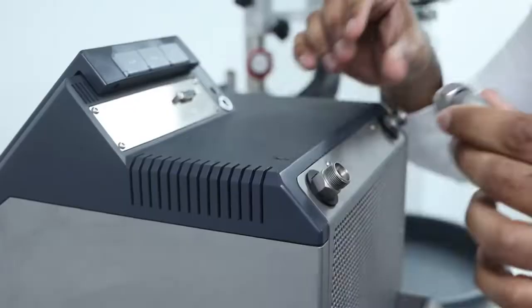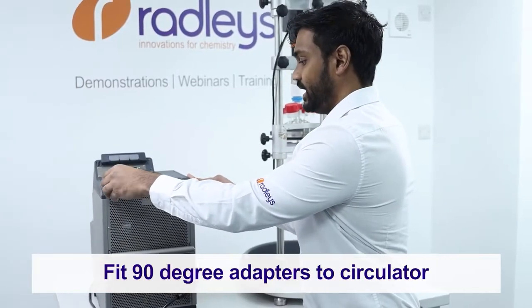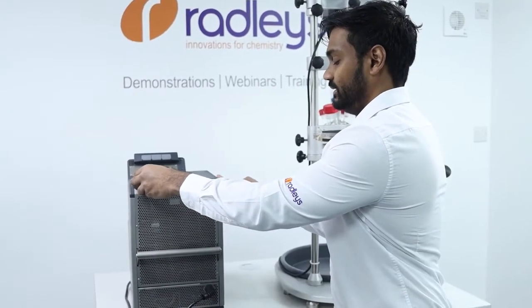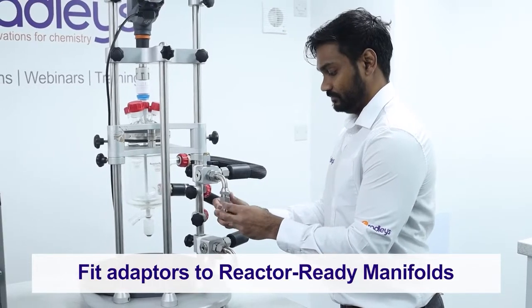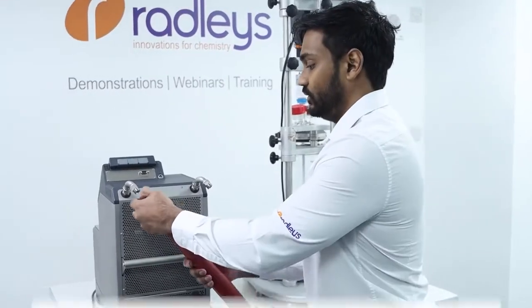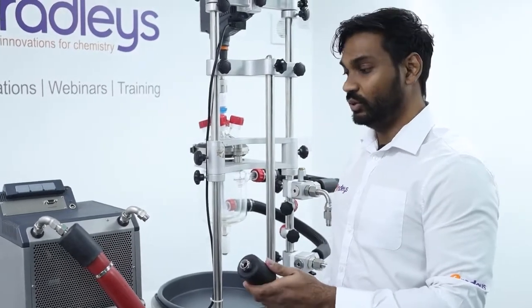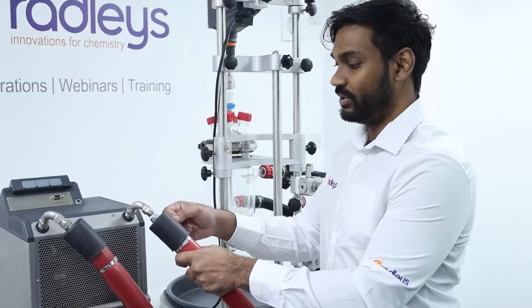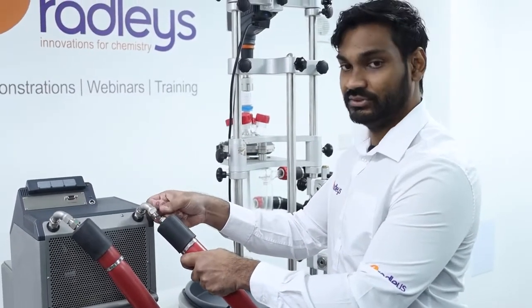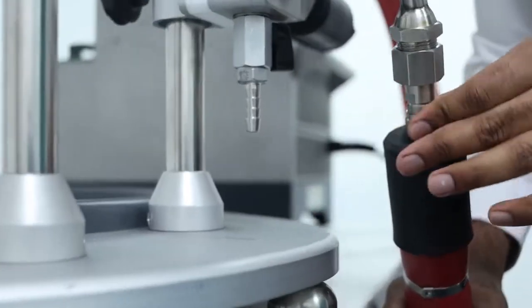We'll start by attaching our 90-degree adapters to our MiniStat. You can do these up hand tight until you're happy with how they sit, and then tighten them up with a wrench. We can then attach our M16 to M24 adapters to our reactor ready manifolds. Now we can attach our hoses to our 90-degree adapters. A tip for getting a good seal between your hoses and any connections is to ensure that the ball joint inside the hoses is pressed right up against the thread of the adapter as you tighten the screw.